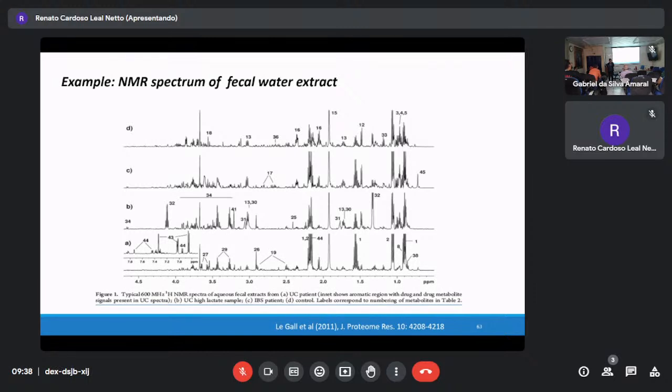Like a blood sample, you can take the supernatant. Then the protein, the white one, is separated, like in cheese or butter, and you take out the supernatant. Yep, done. Can I do an acidification?